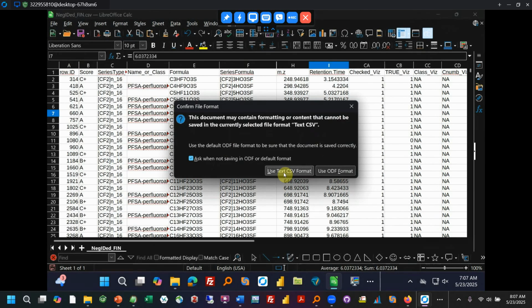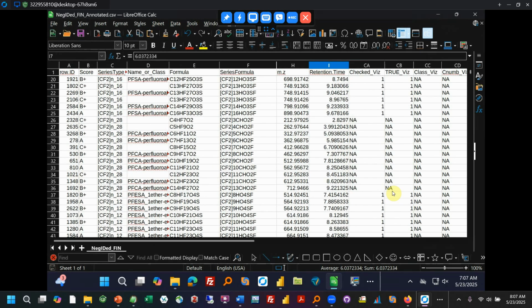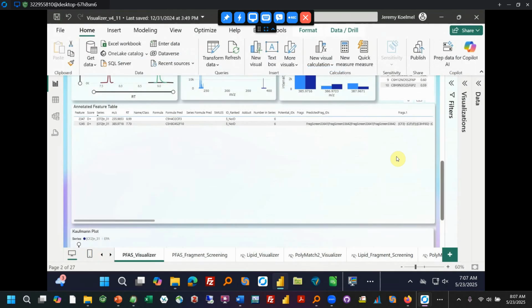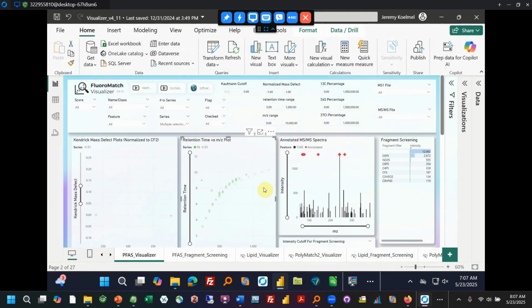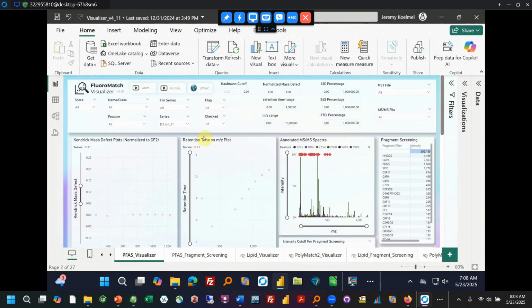So every time that you annotate this, so let's say we saved it now, we wanted to look at the results in the visualizer, and we uploaded them, and then we wanted to continue annotating and look at the results in the visualizer again, we need a new name. So you could do annotated 1, annotated 2, annotated 3. Just the way the visualizer works. So then we close this. And then the way to pull in that data that we have, I'm going to unselect everything. So now this should be, well, and 30, 31, 2, let's see.